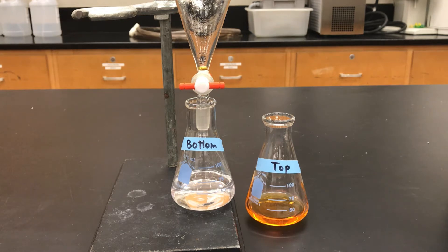So in that case you might want to do a multiple extraction. The whole idea is that there are still molecules left in that bottom layer — can we get more of them out? You're basically going to do that extraction again.